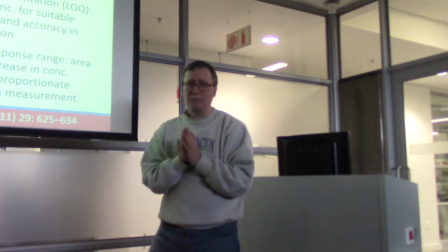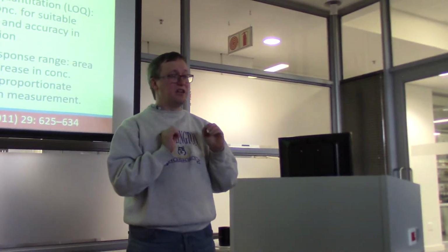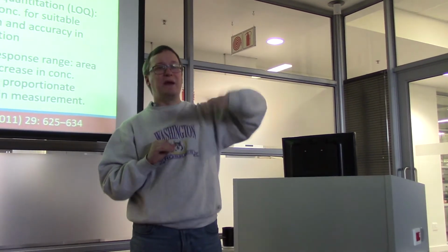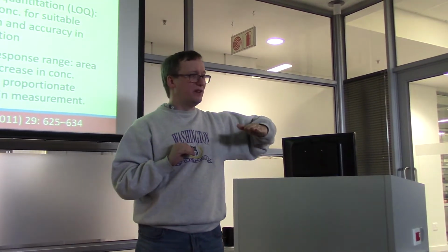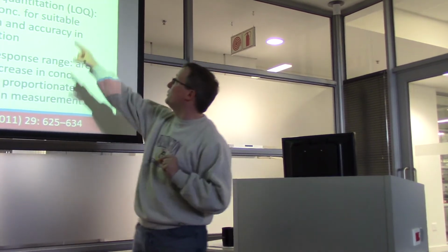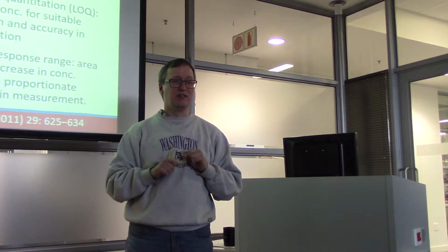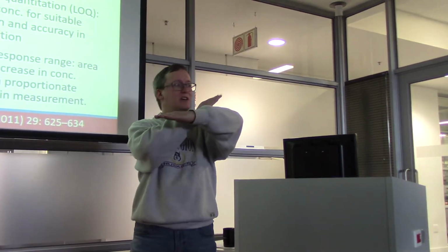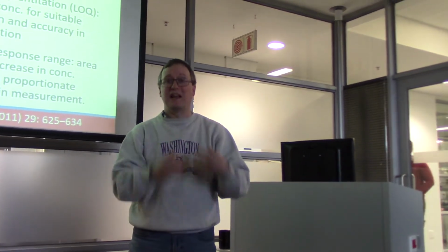Okay, so I would suggest then that a blank sample like this shows you what the amount of intensity would be observed even when 0 is present. Those blanks help you to determine a limit of detection, to say above what level do I need to ascend before I claim that this thing is actually present at all.